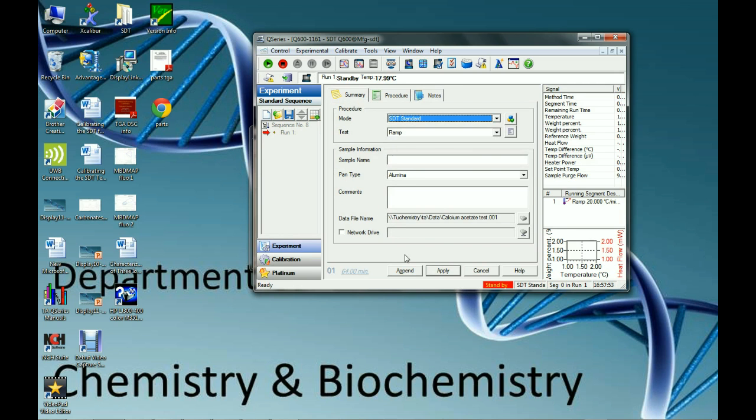So we need to make sure that our flow rate for our nitrogen is at 100 milliliters per minute. So once we have all of that set up, we can apply and start the run.